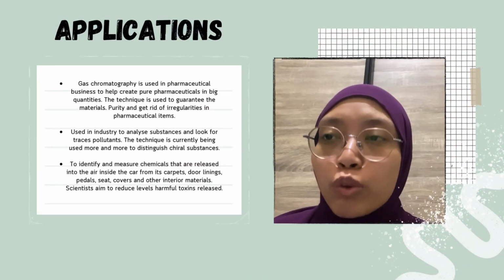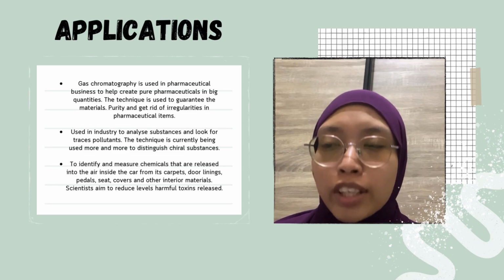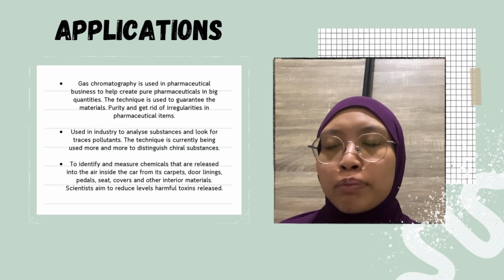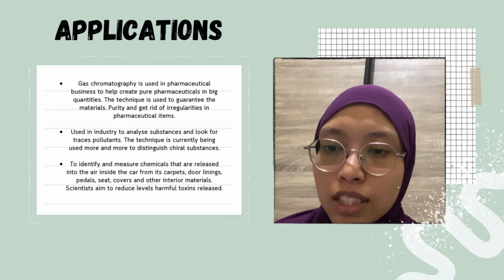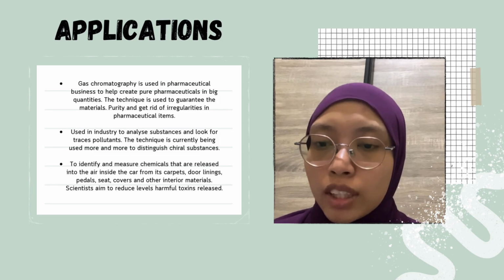Okay, now what applications can we use gas chromatography for in companies or industry? Pharmaceuticals. Gas chromatography is used in the pharmaceutical business to help create pure pharmaceuticals in big quantity.